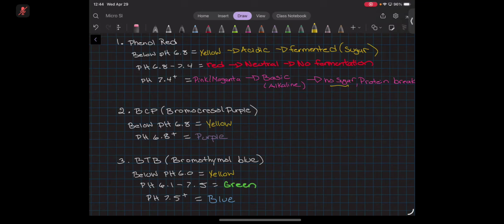Yes. The actual labs that you see are going to be the ones you did in lab. So they're all going to be yellow because they all were yellow except for the ones that were lactose. And what color was that? Purple. But these all might be written questions, so you still need to know this. Plus, these were on your lab notes, on your lab sheets. So all this information's on there. It's all free game. You know how she loves her free game.